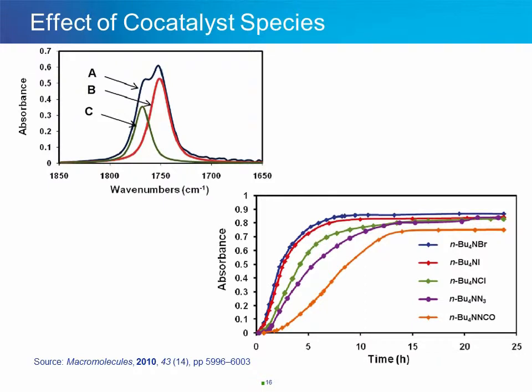I want to add a few of my own insights here. The first is to point out how difficult this data would be to obtain, if not completely impossible, by offline analysis, making in situ mid-infrared spectroscopy a perfect tool and a very enabling technology. The second is that, for those of you that read the paper in detail, the spectra were deconvolved to give the chemometrically derived pure component spectra that were needed to generate the concentration profiles without having interference from the other component.